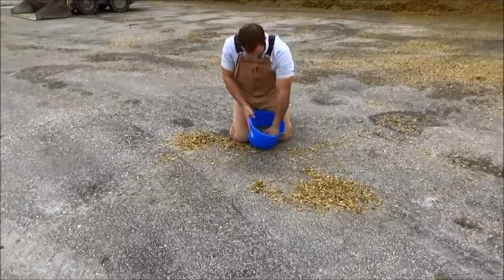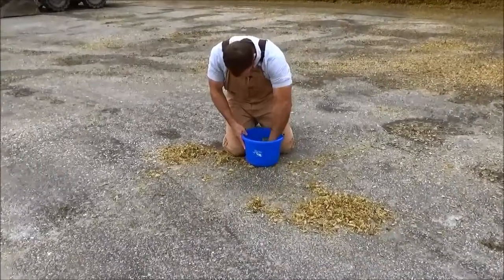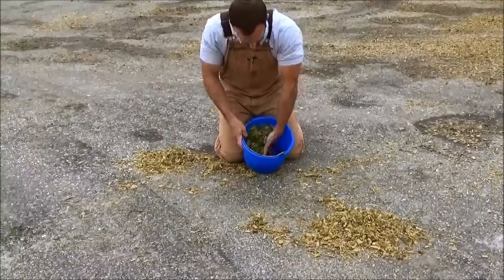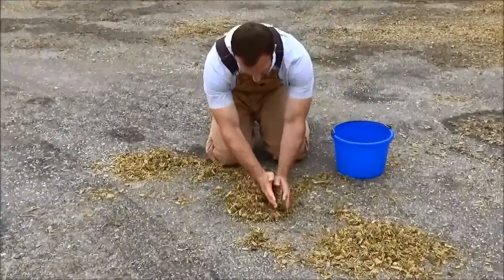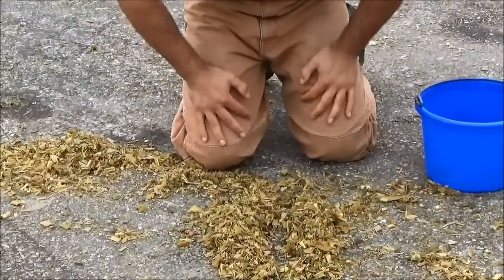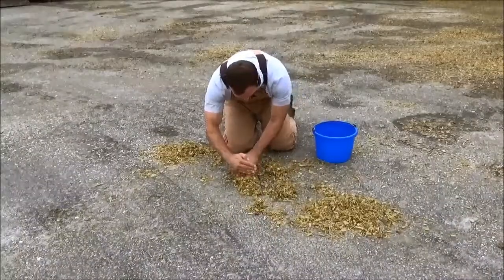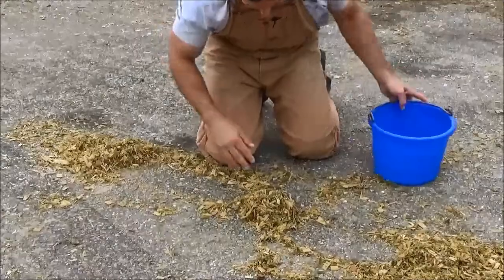Now we've got about half of what we had prior. It's the same technique — turn this over, mix it back up, turning it over, then dump it out again. In about two reps through this mixing and quartering you should be able to get down to the appropriate sample size. I'm going to take two quarters, discard them, and we'll be able to get this into a quart bag.